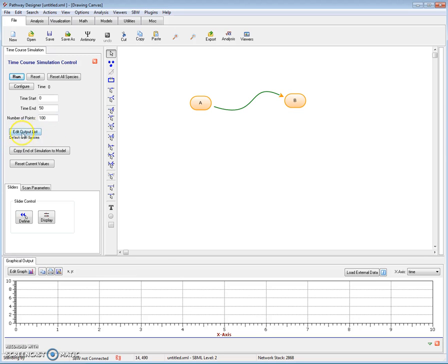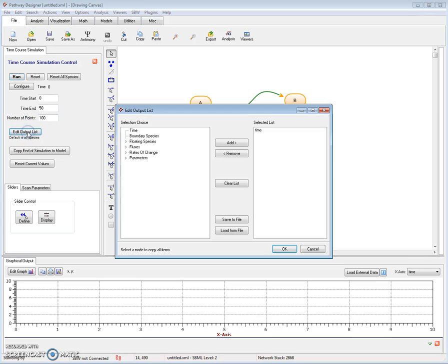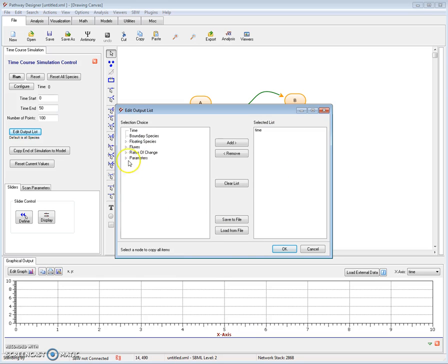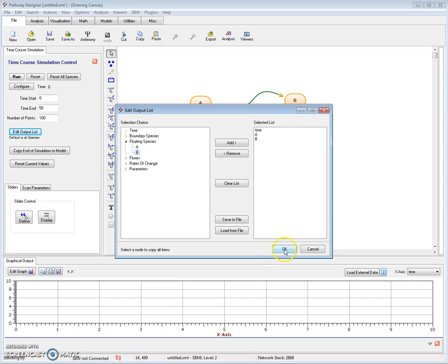To do that, I click on the edit output list. And here I have things that I can get plotted. This is the list that on the right will actually get plotted. What I want to plot is A and B. I double click A, double click B. And you can see on the selected list, I get time, which is the x-axis, and A and B, which is the y-axis.